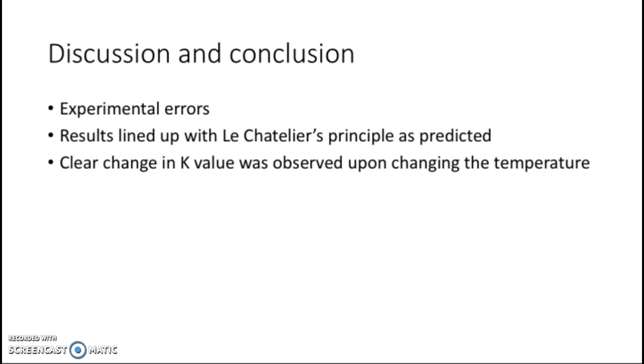And we also observed that a clear change in K was seen upon changing the temperature. And that's pretty much all I had to say for this experiment and report.